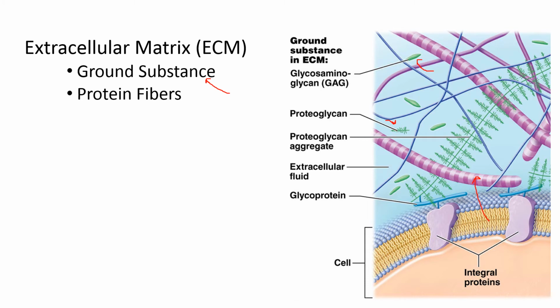Second type of protein fiber that we'll see sometimes is the elastic fiber. And elastic fibers tend to look like threads. Often they're stained dark purple or black, but they'll look kind of like little thin squiggly threads on the microscope image. Third type of fiber is the reticular fiber. Looks kind of like this.